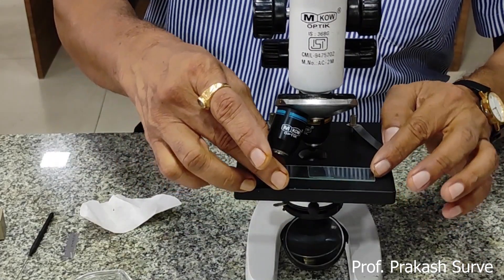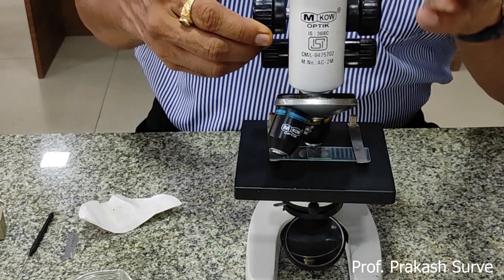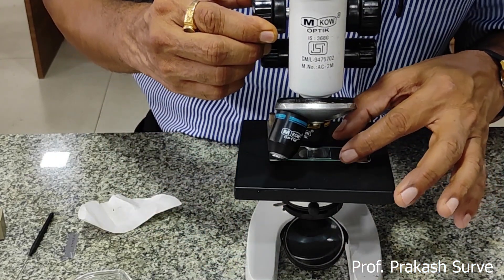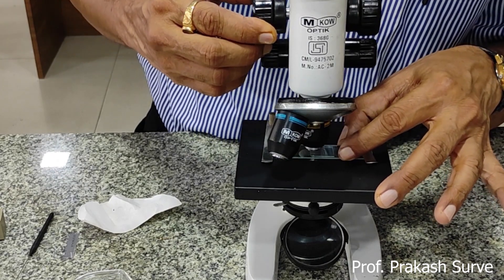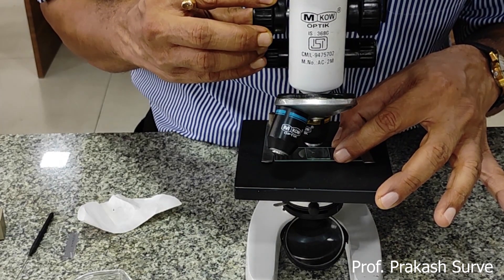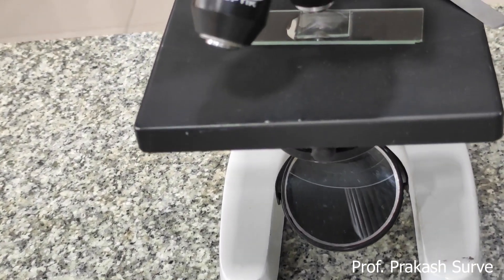Now place that slide under the compound microscope under 10x power of the objective. Fix the approximate position of the slide. Watch through the eyepiece, which is of 10x power. Get the maximum source of light through the concave mirror. First do the rough adjustment with the rough adjustment screw, then do the fine adjustment screw.